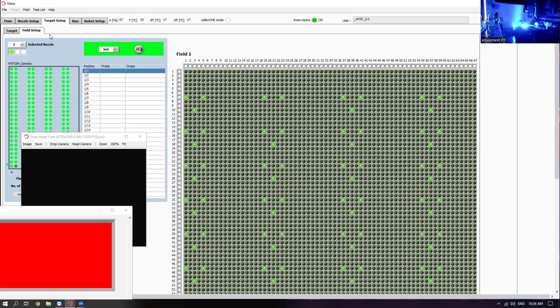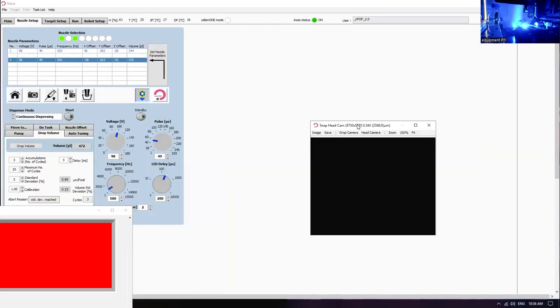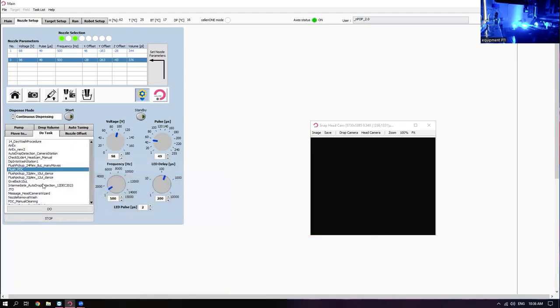So, all right, we have our slide selected. Next, I'm going to go in and we're going to aspirate our cells. We're going to take cell and wash cells.